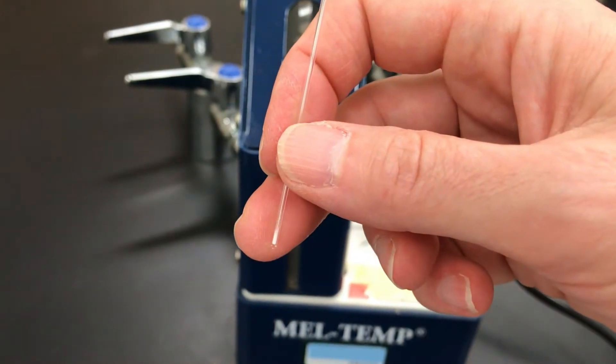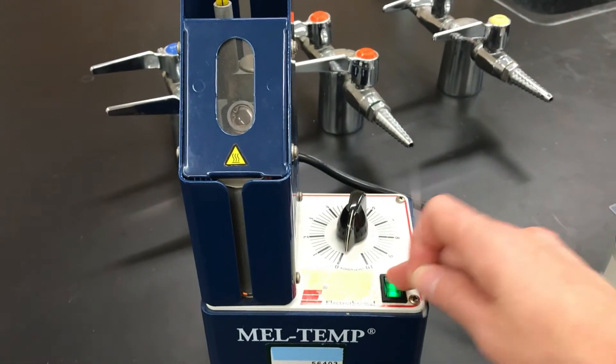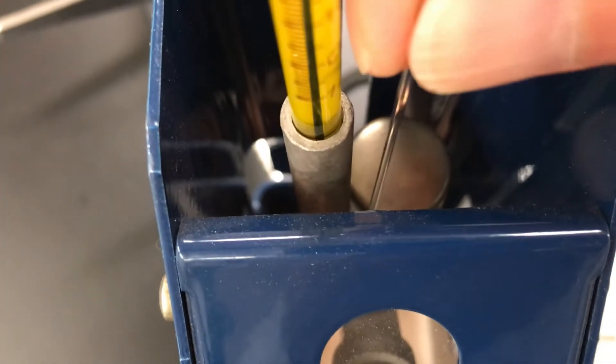The sample is now ready to go inside of the melt temp. I like to first turn it on so that it turns on the light and you can see what's going on inside. You'll see that there's a metal block with three little slots, and you want to position your capillary tube with the closed end down inside of one of those slots.